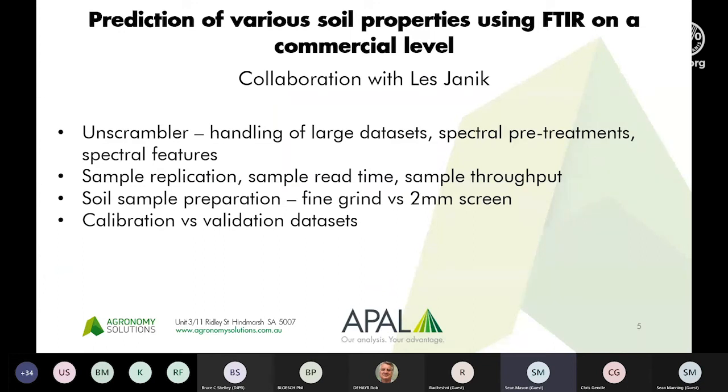Being the largest commercial lab, we were able to touch base with tens of thousands of samples. We probably screened 100,000 samples, but using Unscrambler with large data sets is quite cumbersome once you get above 10,000 samples in a calibration. So collaborating with Les was great, excellent on the research side of things, and we really needed this instrument to be working on a commercial level. Les went through all the details of Unscrambler, and we alluded to the handling of large data sets, which has become a problem now. Possibly we can touch on that a bit later. So we're looking at other data packages to handle that.